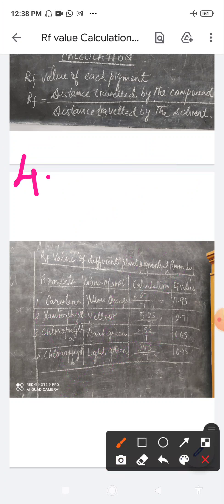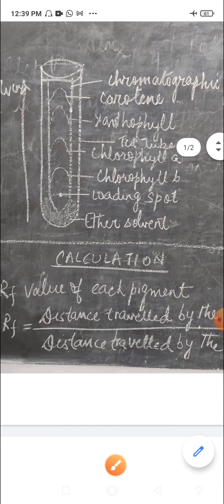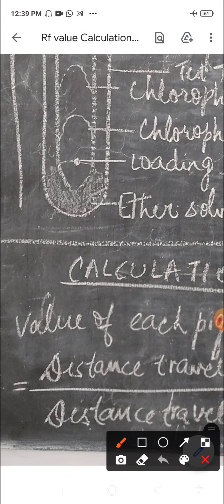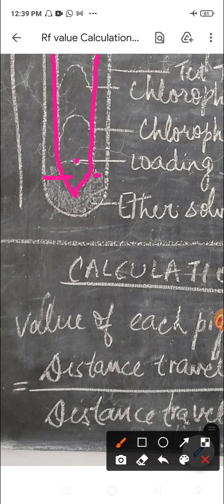The fourth precaution: while hanging the strip in the test tube or beaker, the loading strip should remain about one centimeter above the solvent. You can see in the diagram that the loading point is one centimeter above the solvent. The fifth precaution: the chromatographic paper strip should not touch the walls of the test tube or beaker — the paper strip is not touching the walls, which is very important.